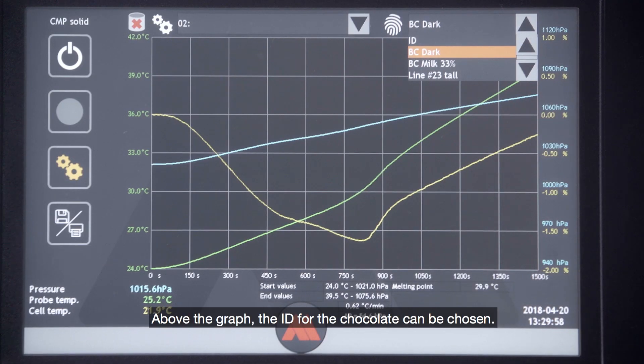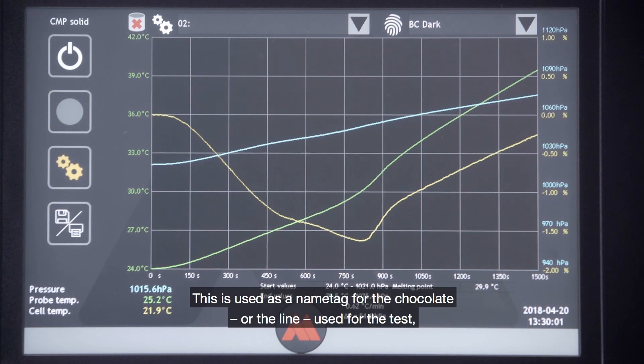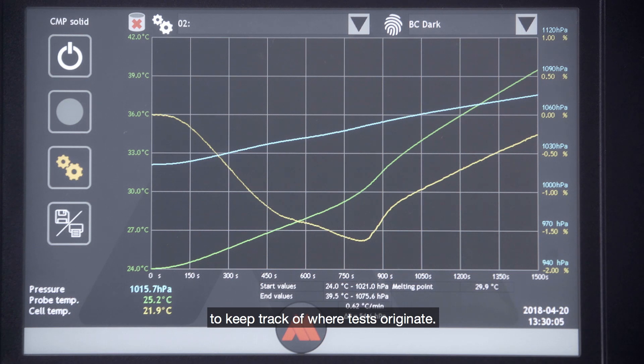Above the graph, the ID for the chocolate can be chosen. This is used as a name tag for the chocolate or the line used for the test to keep track of where tests originate.